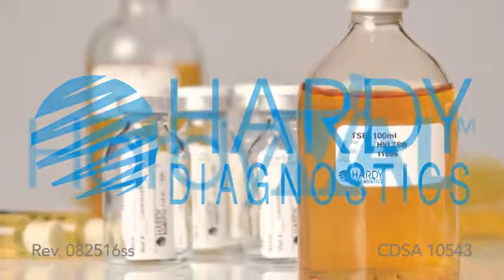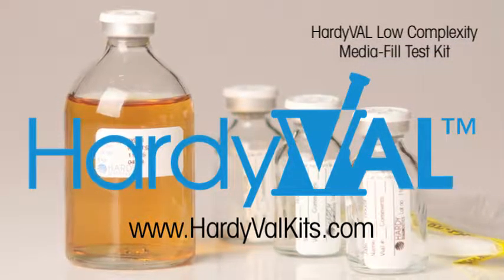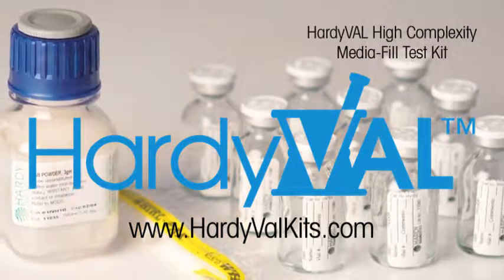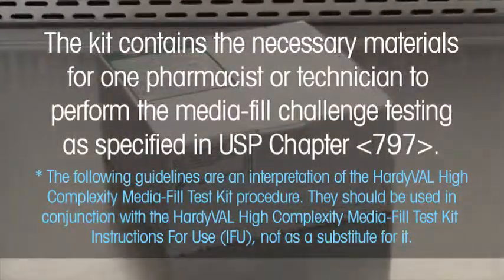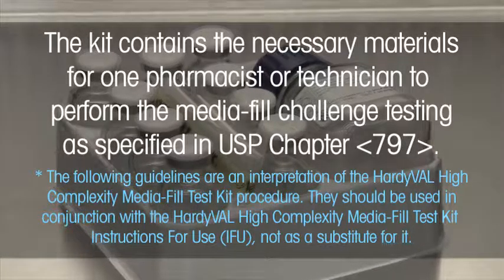Hardie Diagnostics HardieVal MediaFill Test Kits are recommended for routine use in the monitoring of aseptic procedures used in compounding sterile preparations. The kit contains the necessary materials for one pharmacist or technician to perform the MediaFill Challenge testing as specified in USP Chapter 797.